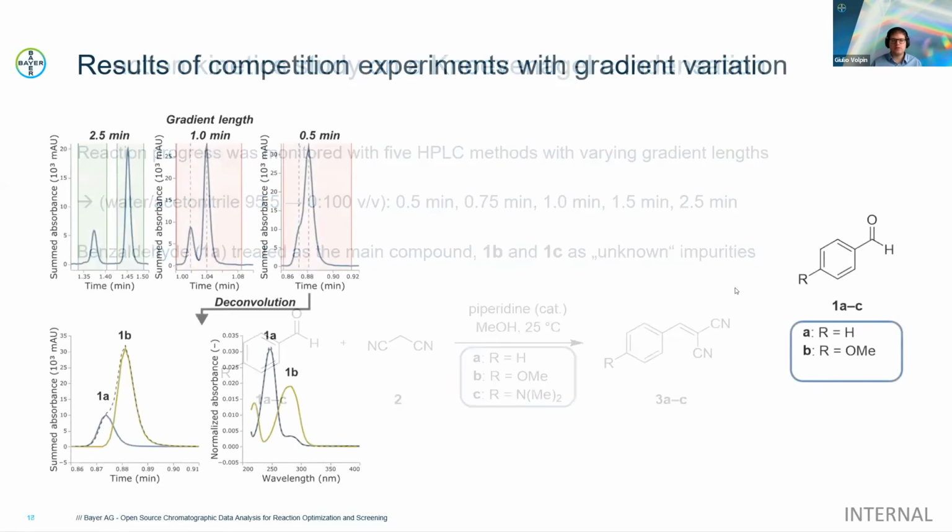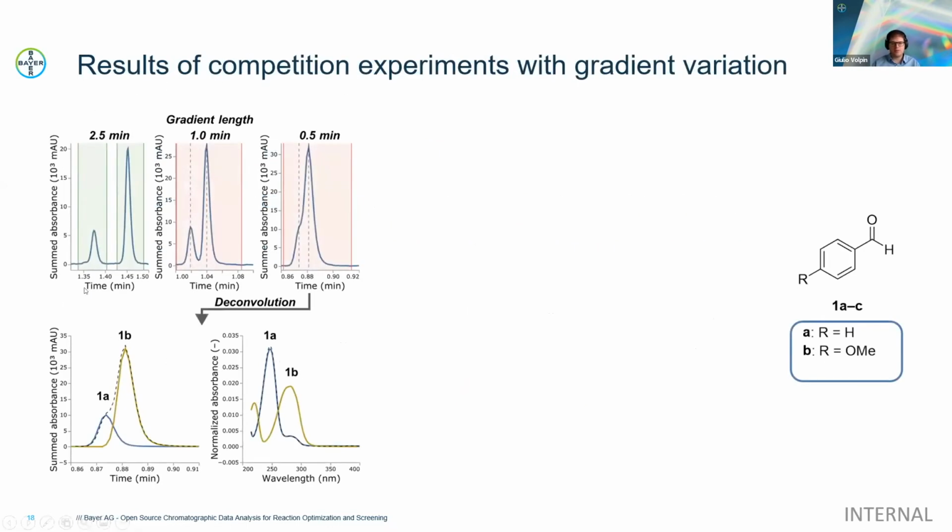And so how this looks here, again in reports generated by MOCCA, is that if you have a two-component mixture as a competition experiment with malononitrile, you see the two products form in different ratios. And in this case, they are baseline separated, as indicated by the green highlight.